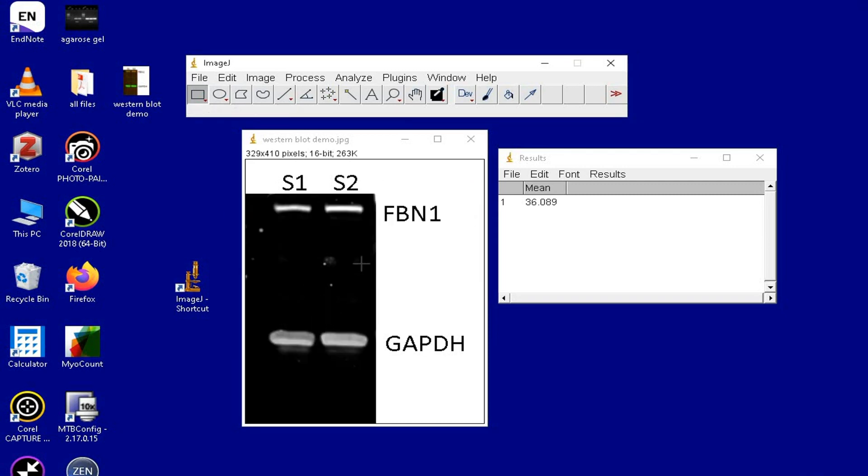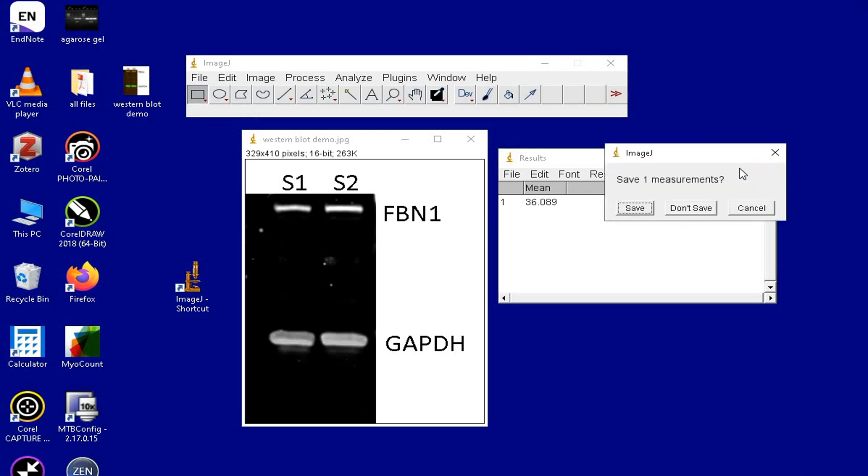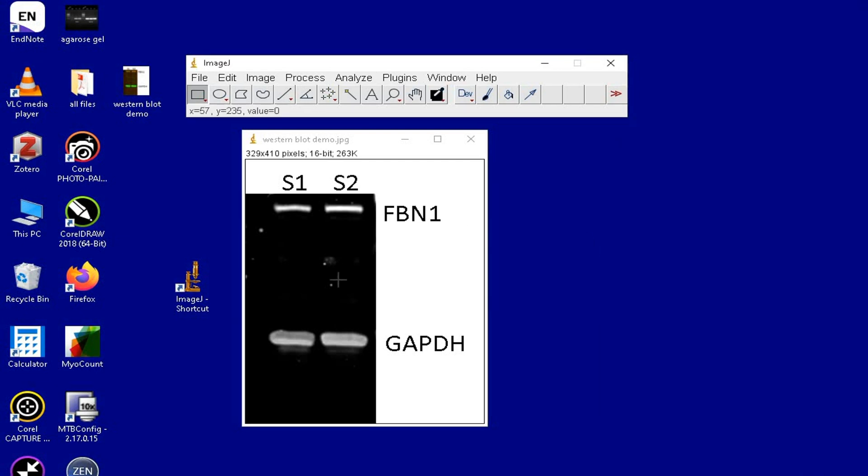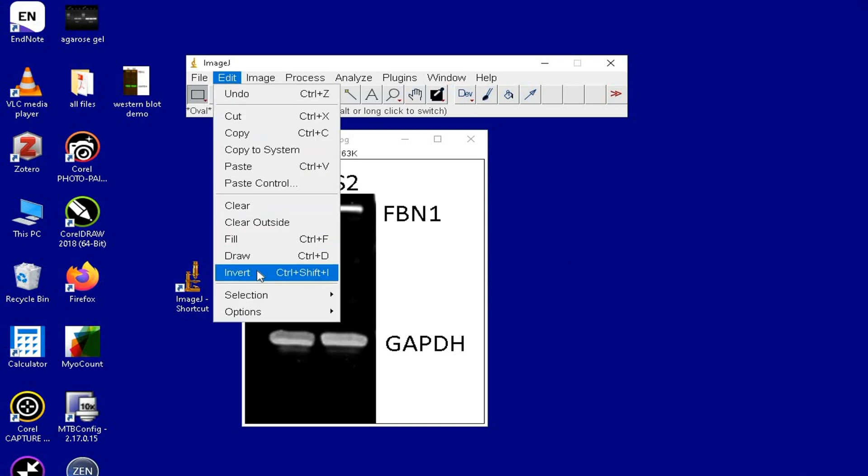Now, the background or the noise is successfully removed from the image. Next, invert the image so that the bands in the blot appear black in color in a white background.